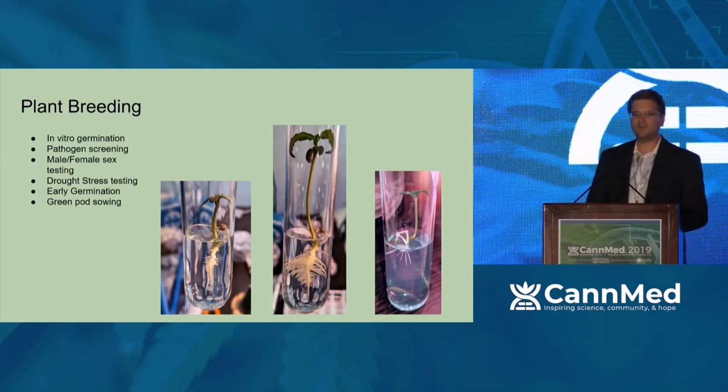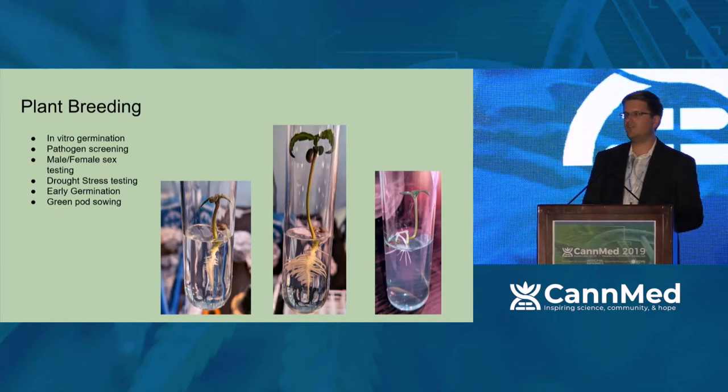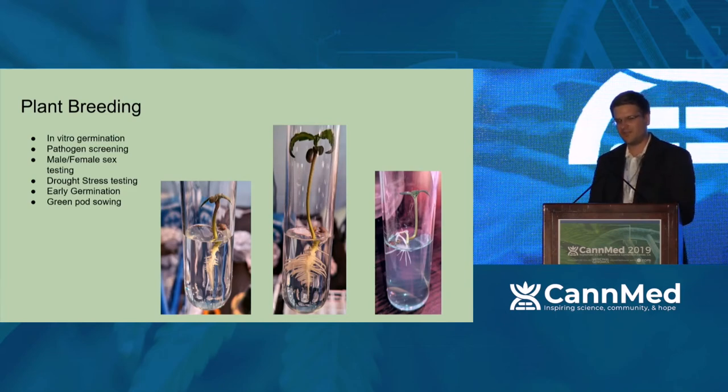The other one is green pod sowing, where you can actually pollinate a female plant and wait a week until the seed starts to develop. The embryo develops first, and then the seed coat develops around the embryo. When you pull the seed early and the embryo is developed, you can actually put that in culture and grow it out, and you can cut months off your breeding cycles every generation because you're not waiting for a seed coat to develop with all the nutrients, hormones, and vitamins the plant needs in order to grow and keep it alive within the seed coat itself.